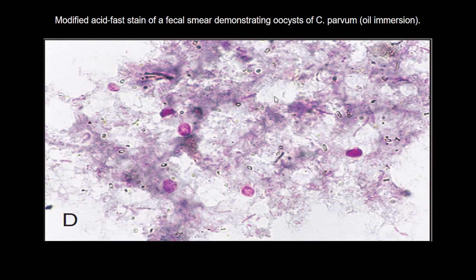And some patients that have severe watery diarrhea caused by the Cryptosporidium parvum can be stained with the acid-fast staining.